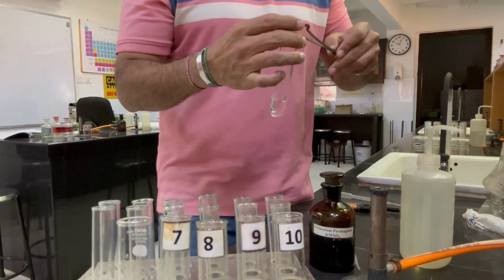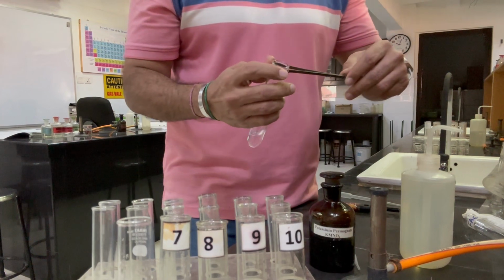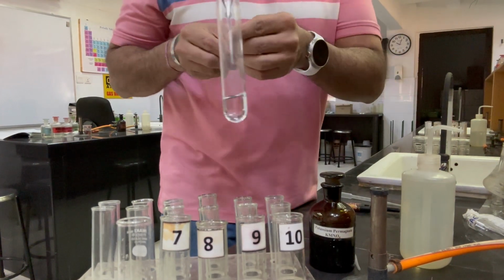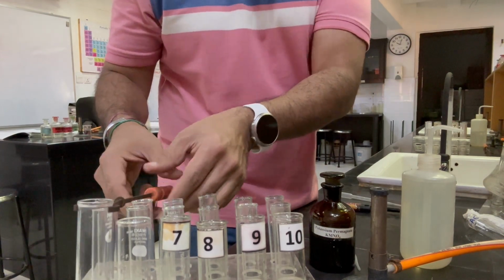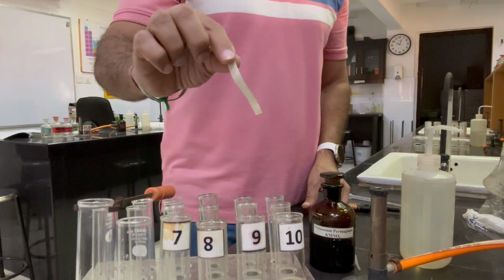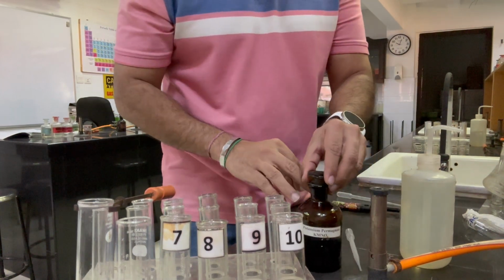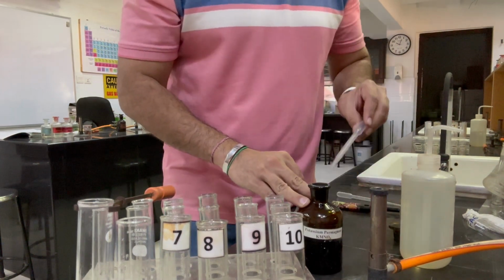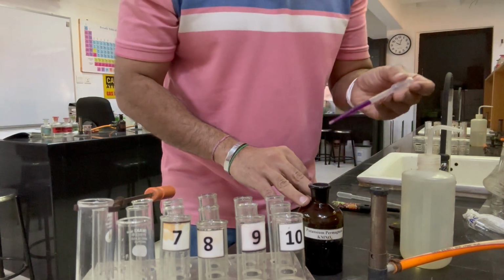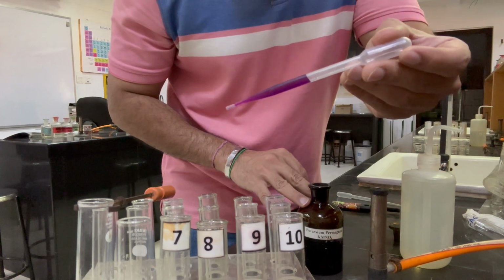Let me warm the solution produced. We will put the test tube holder there, and now we will put our potassium manganate dipped paper. We will take this filter paper and make it damp using this purple solution, which is potassium manganate.